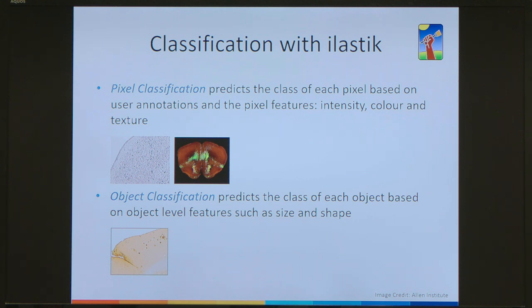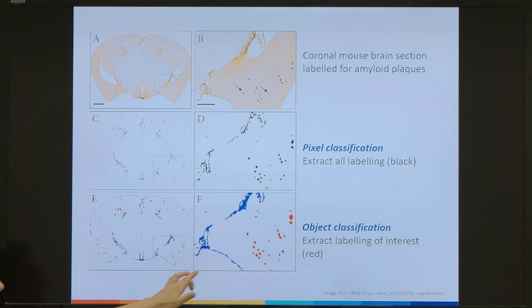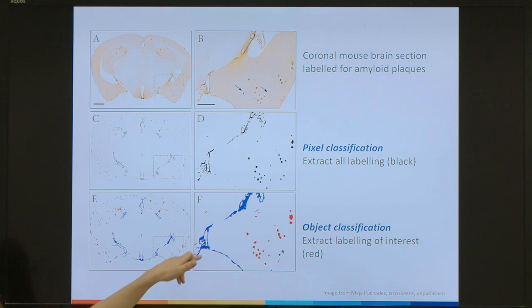In some cases the segmentations you get out are not good enough for quantification because you might have a lot of non-specific labelling pulled out. In this case, it can be useful to do an object classification step, which follows the first step, where you can filter out objects based on object-level features such as size and shape. Here's an example with a section labelled for amyloid plaques — after pixel classification you have non-specific labelling around the edges. The object classification workflow classifies based on object size and shape, since the circular plaques are very different from the elongated non-specific labelling.